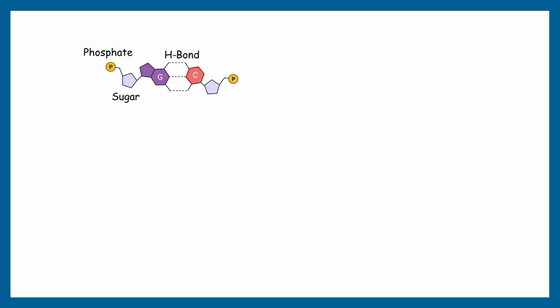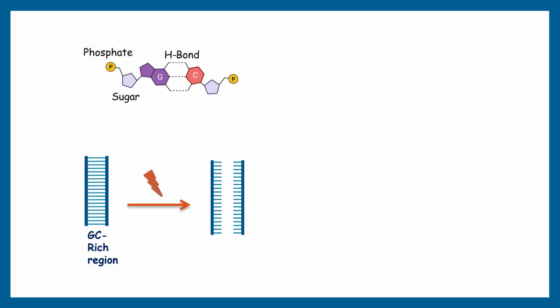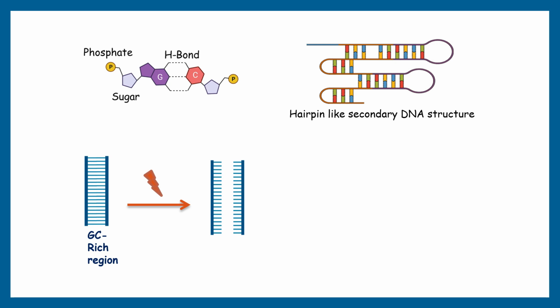So there are two common problems with high GC content DNA in PCR amplification reactions. First, G and C contain triple hydrogen bonds, which require a higher temperature to break them. Second, more GC-rich templates form many secondary structures in the DNA template, and these secondary structures are hard to open and amplify, so we can't get good amplified product. There might be non-target amplification, primer-dimer, or unwanted amplifications.